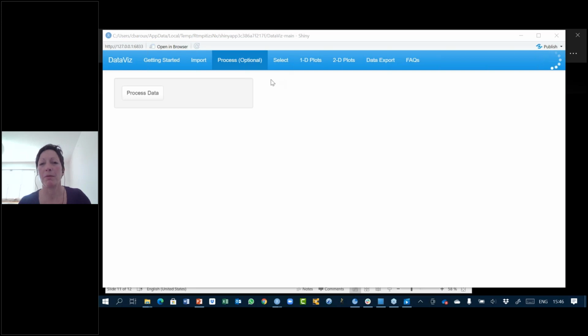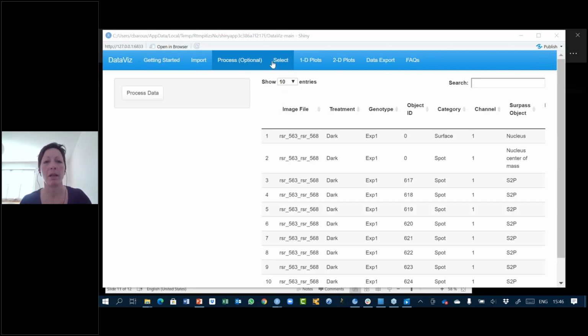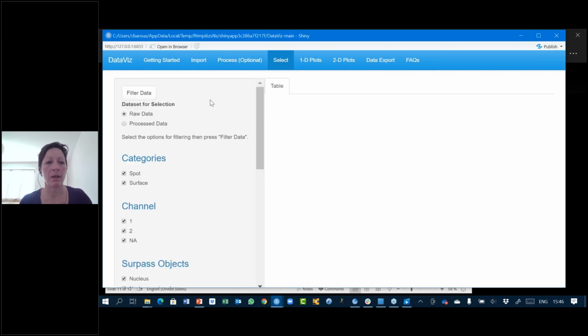Yes, it's going to be difficult for me to process it now. I had to restart it just before the webinar because I've been playing so much with it on my small laptop that it was a bit overwhelming. Okay, and now in the select stage, I can say that I want to use process data.